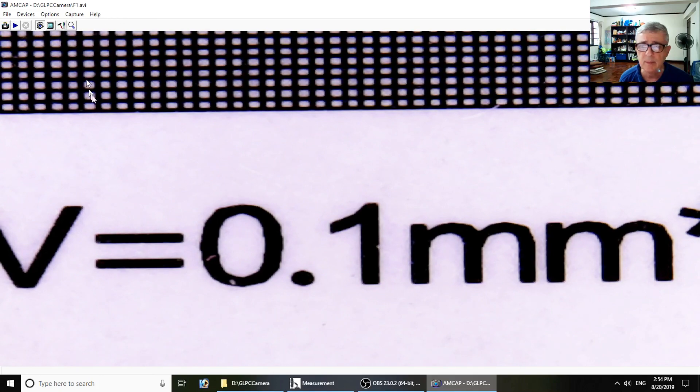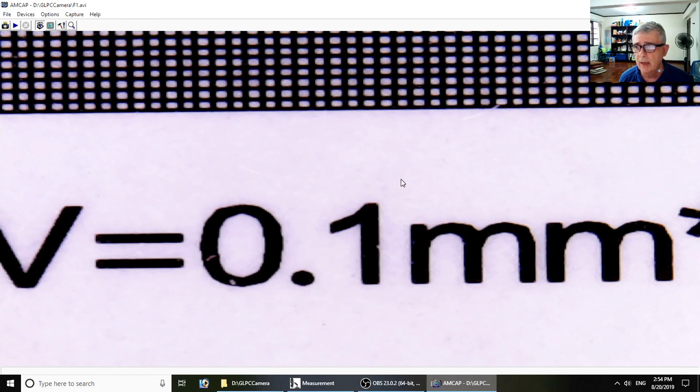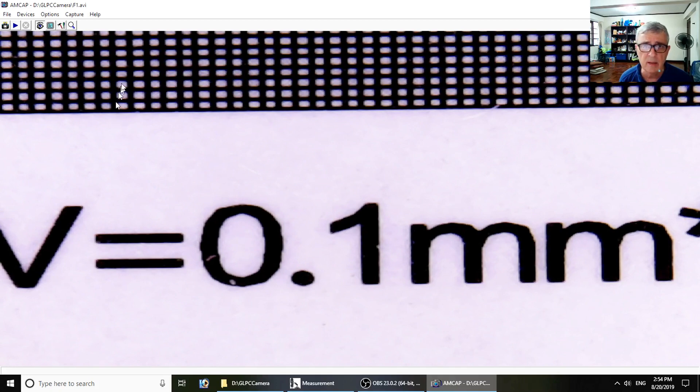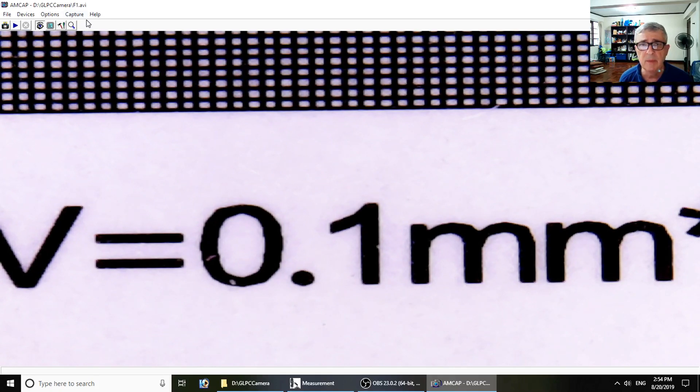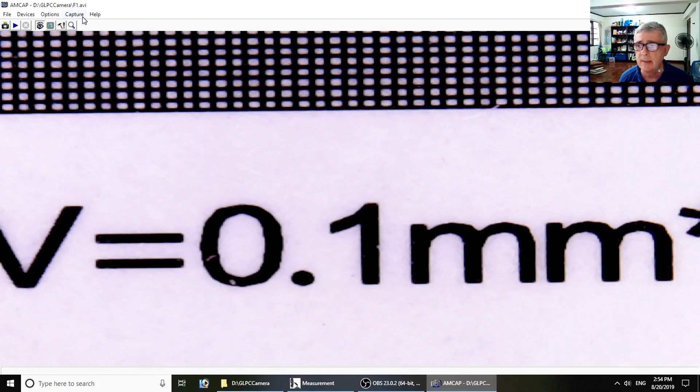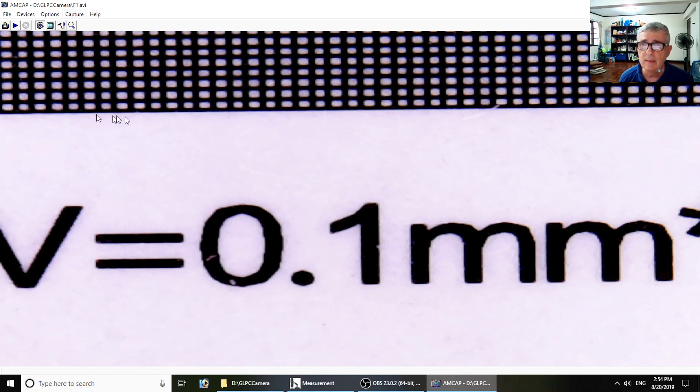That's pretty much the software, and then it's got buttons that do the things we just talked about. It's good software, it's not great software. I wish it would remember the defaults for image sizes, but overall it's not bad. I will take it.